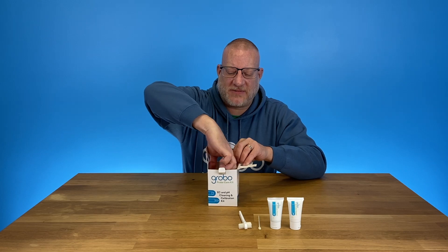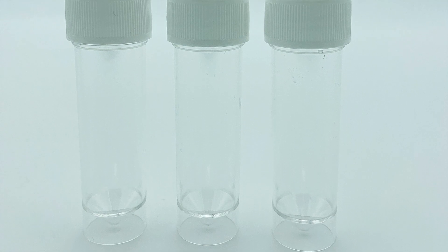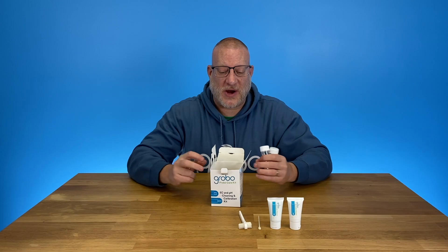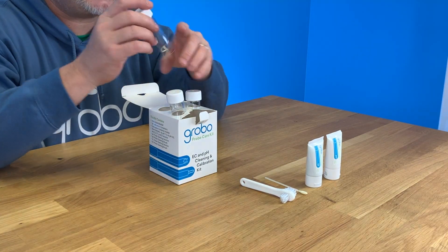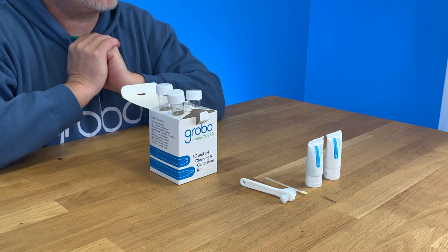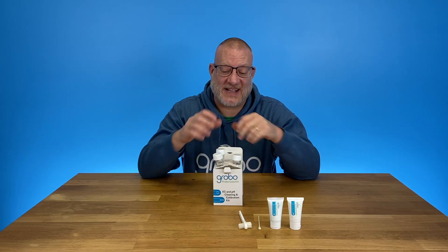We have three different containers for you to use, and they actually work with our patent-pending super cool design box so that your pH probe or EC probe don't tip over when you're calibrating anymore. So that's super cool.